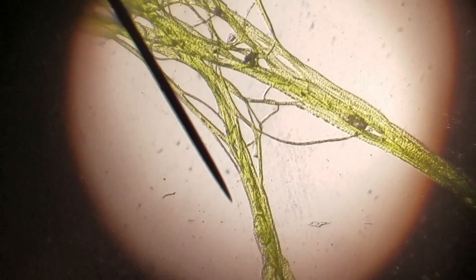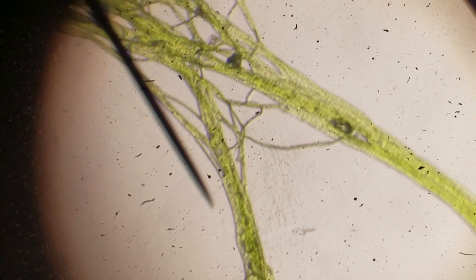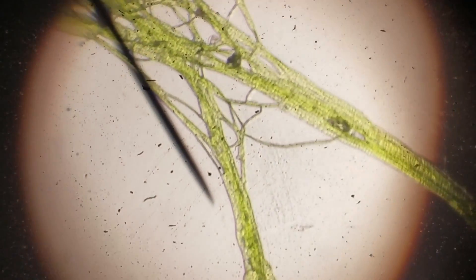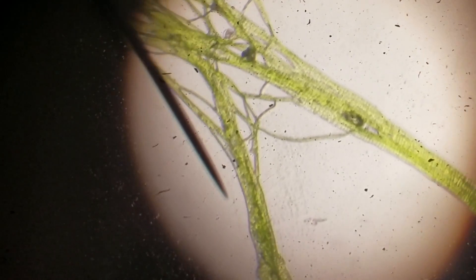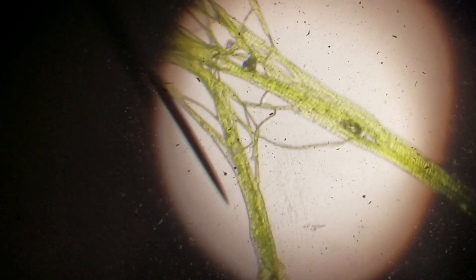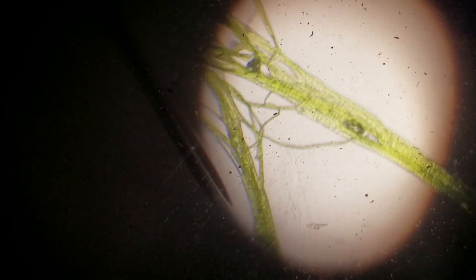Let's try to zoom in. We'll try to zoom in on the microscope but the light is going to get played with. So you can kind of see the different cells — the little dots. If you look at the filament to the right on your screen, every so often it comes into focus.